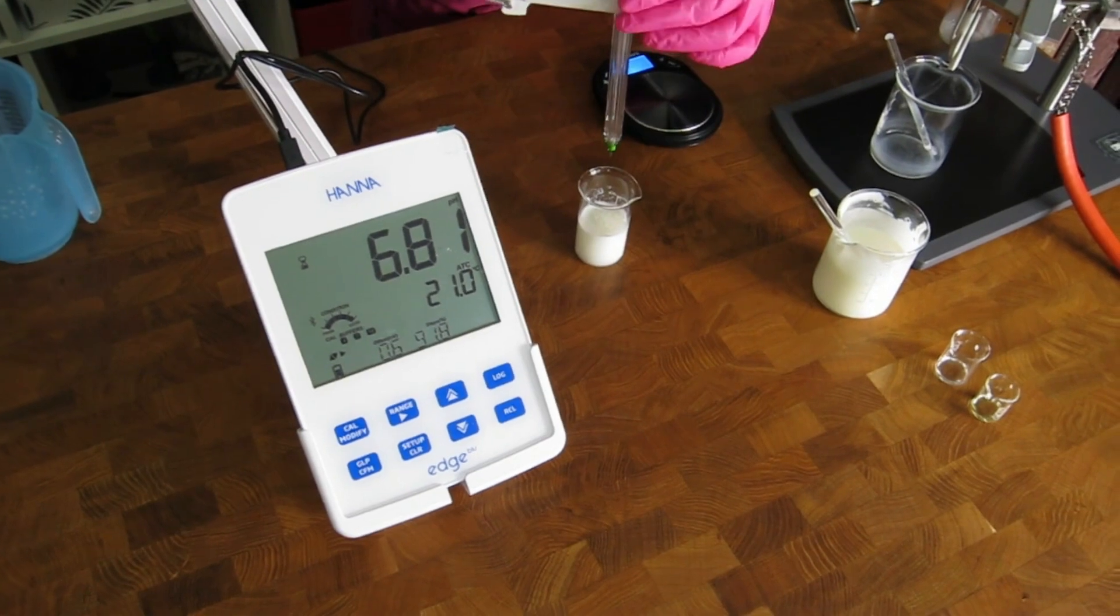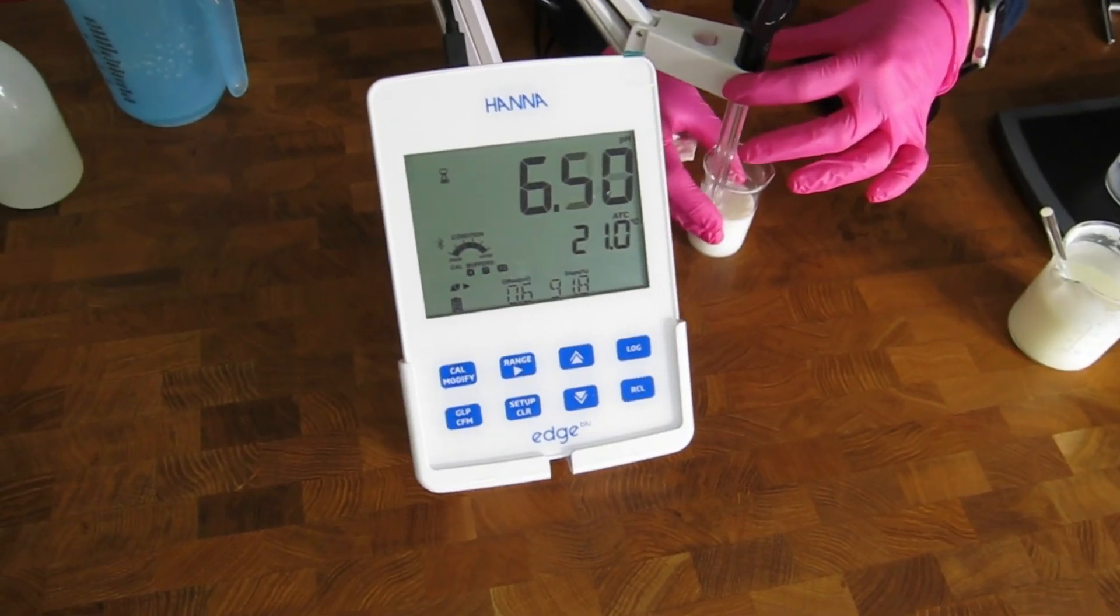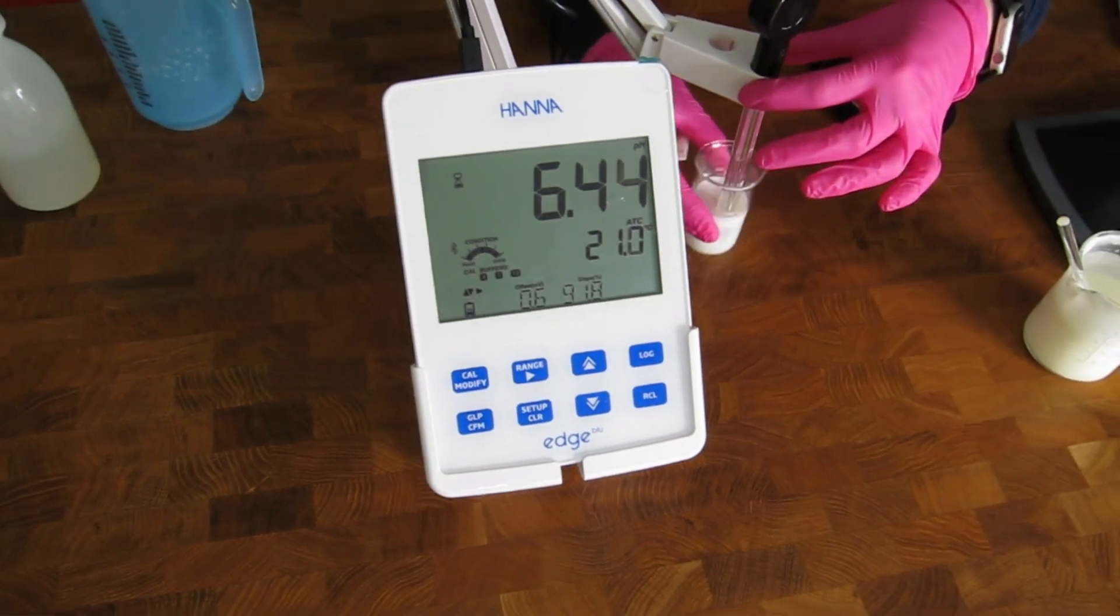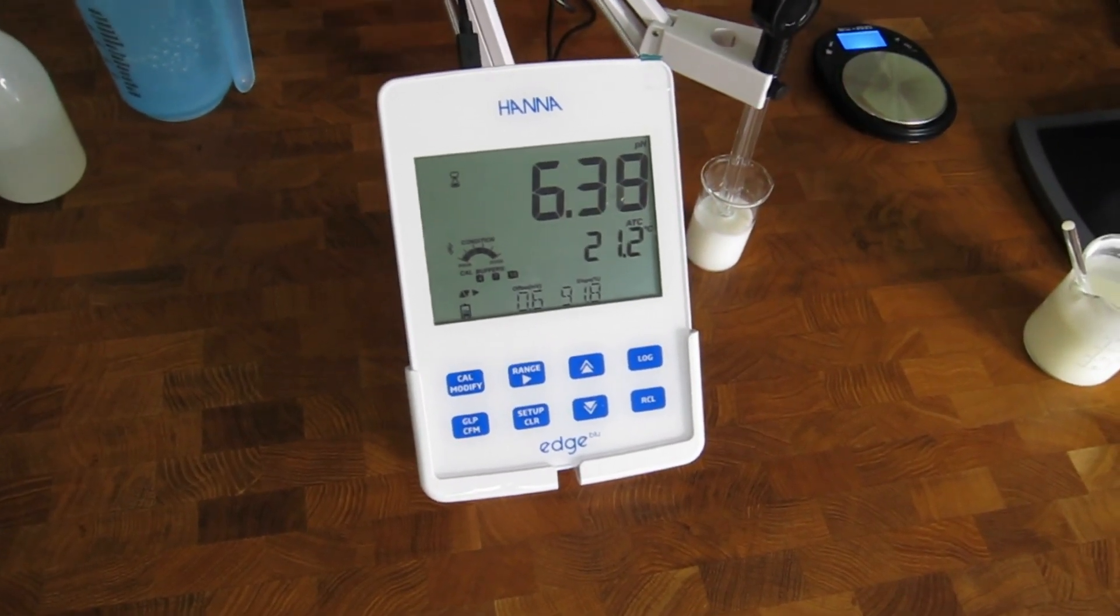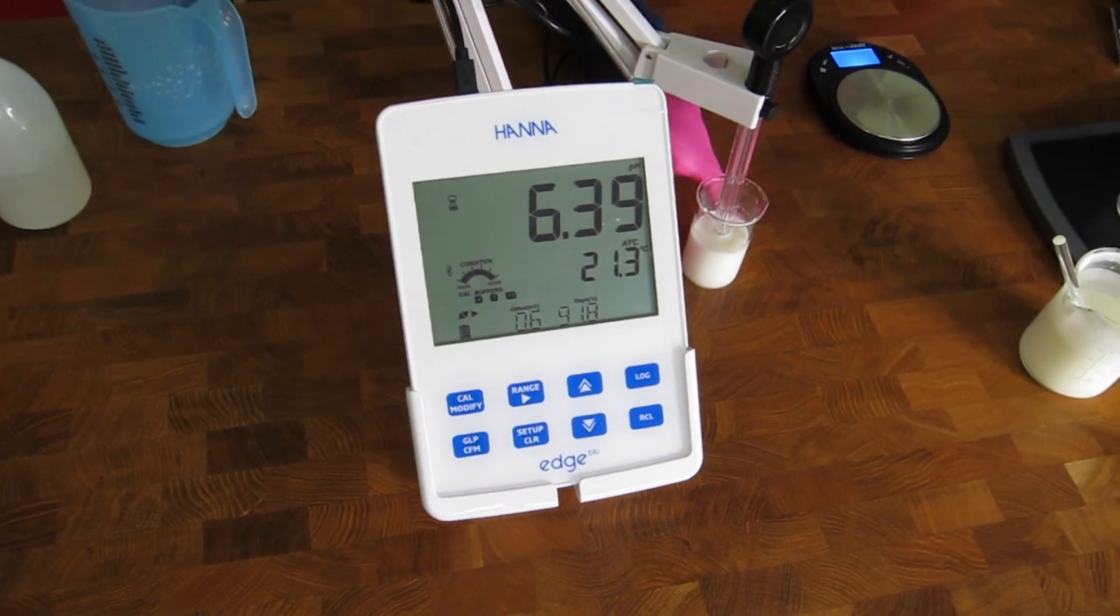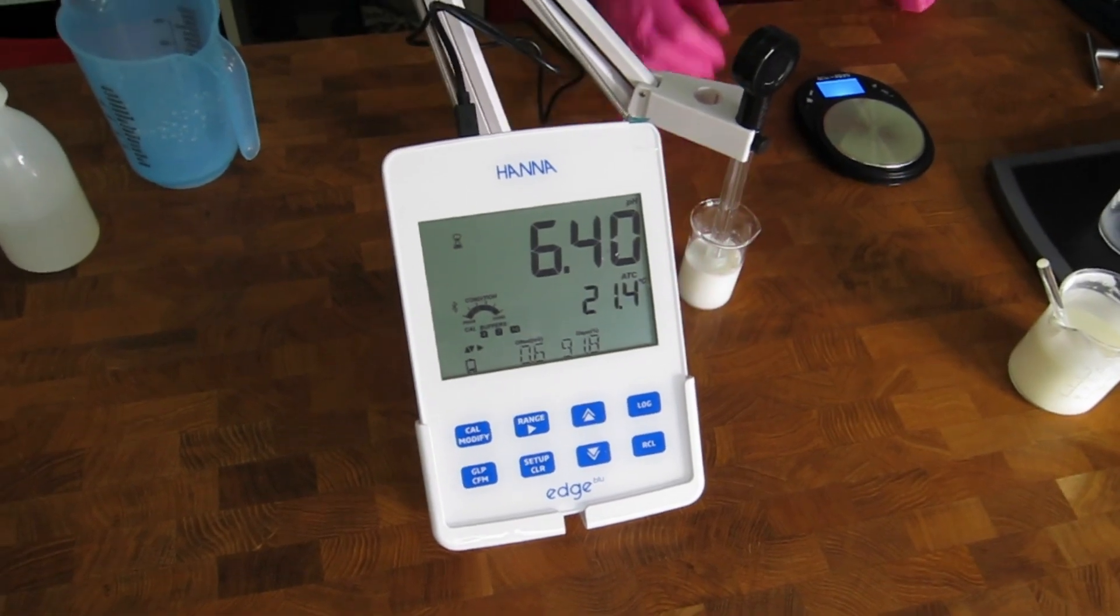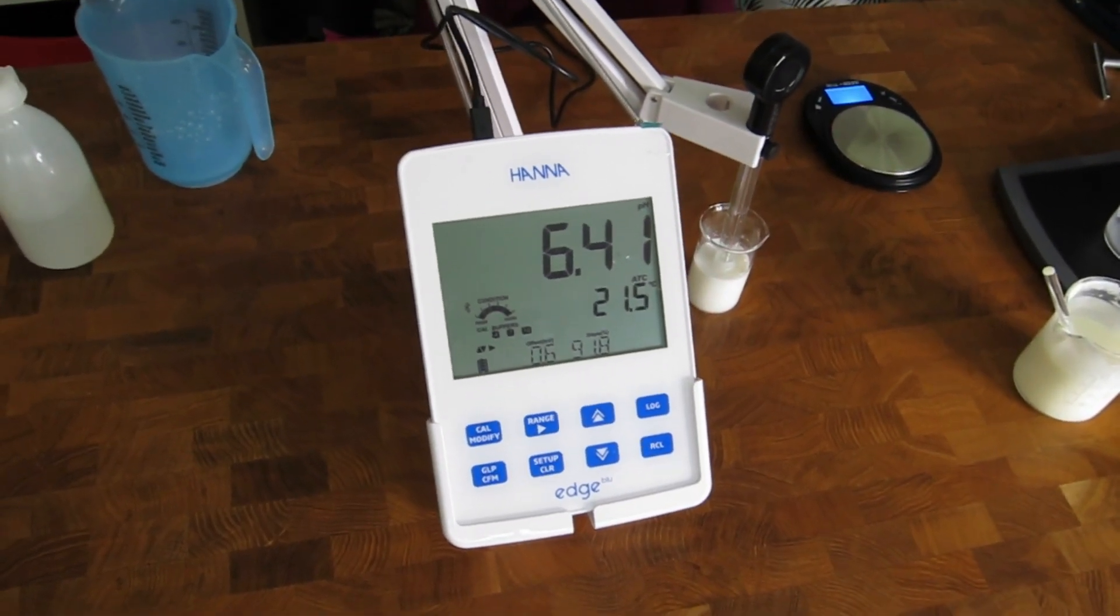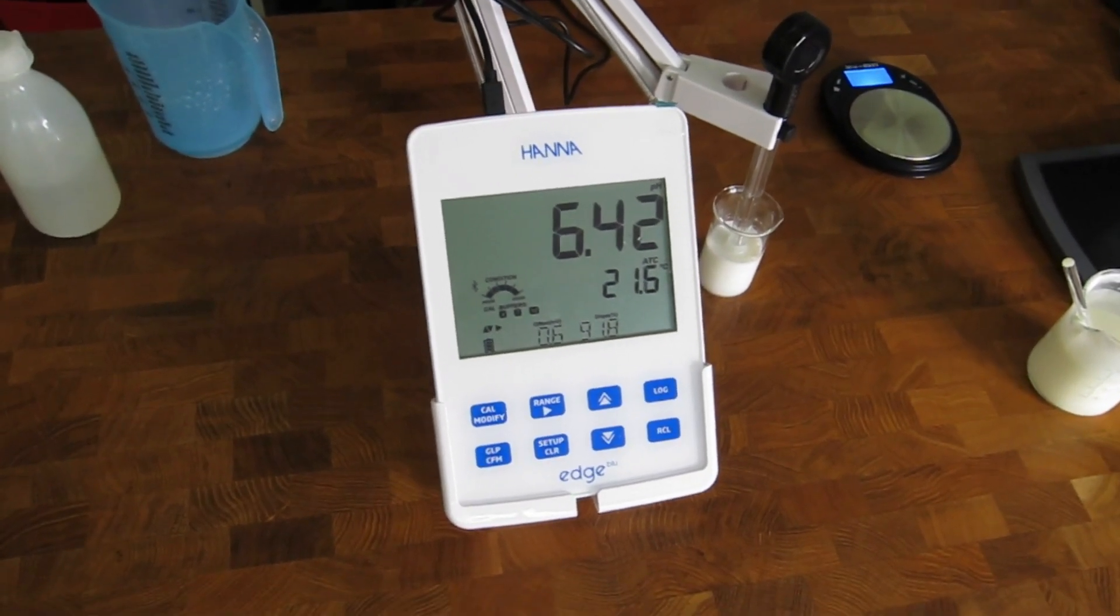Our pH meter is calibrated so the pH is 6.39, which is slightly higher than our range. We will add the preservative, the essential oil, and then we will reduce the pH by adding lactic acid.